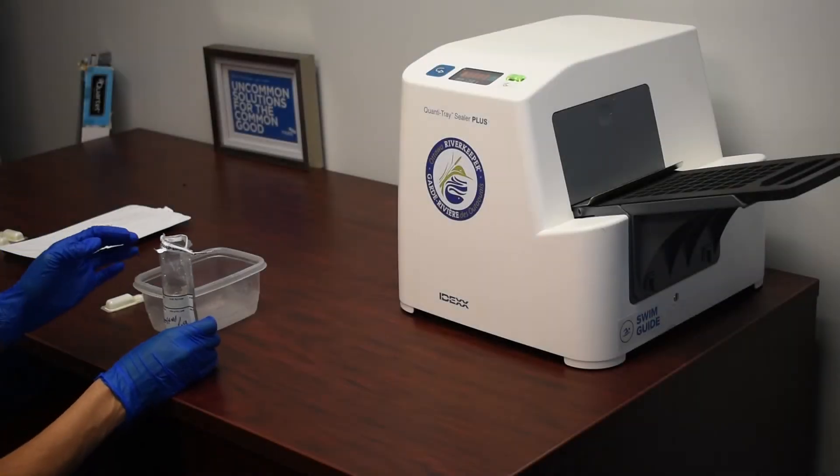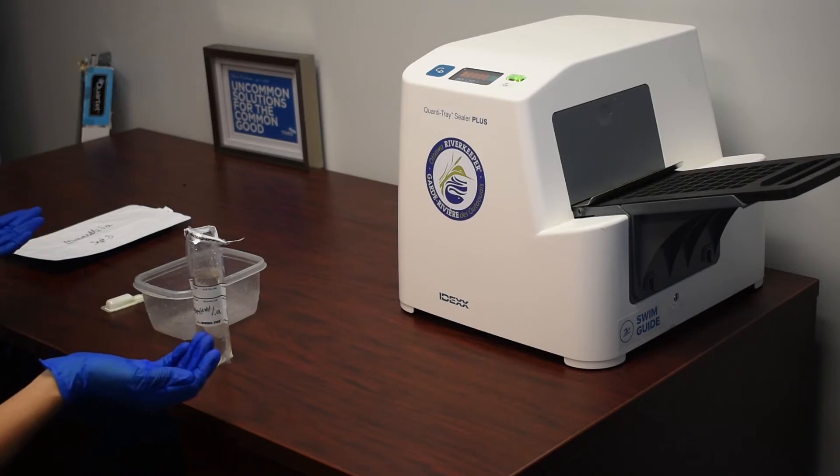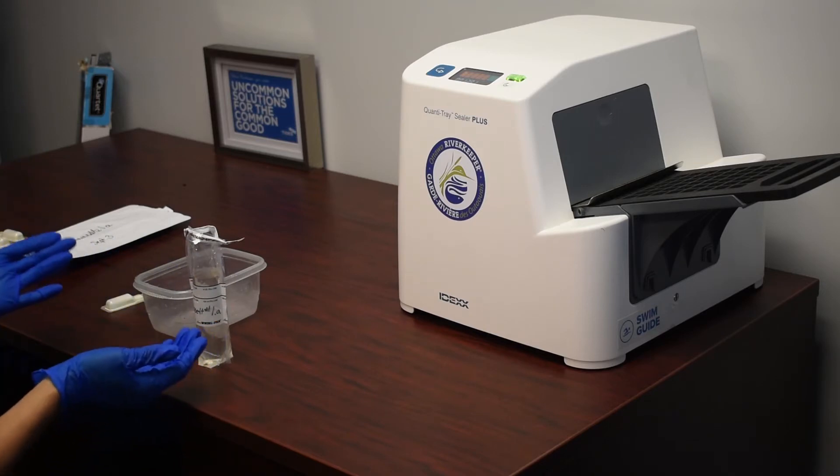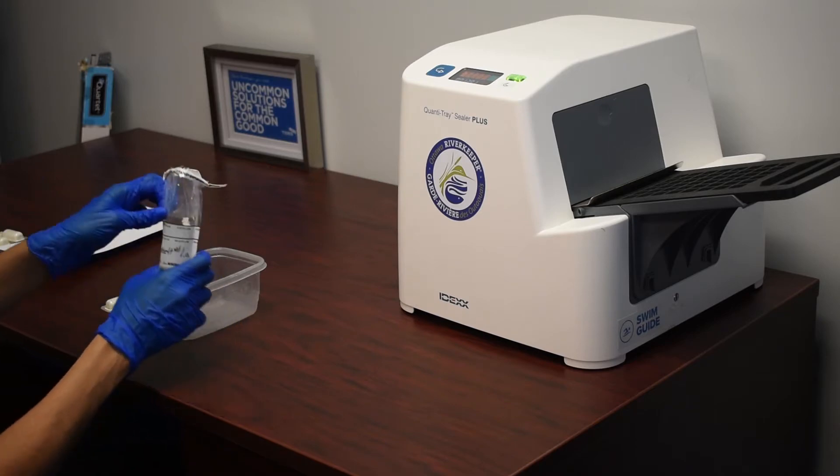Once the samples have been brought to the office, we then process them. First things first, we need to ensure that our samples contain just 100 milliliters of water.